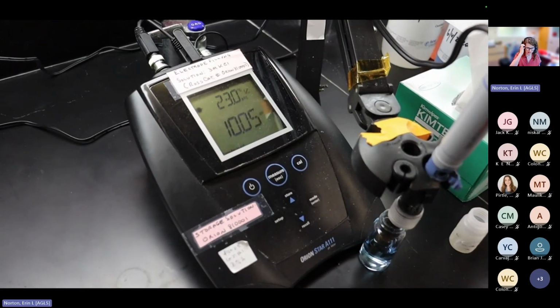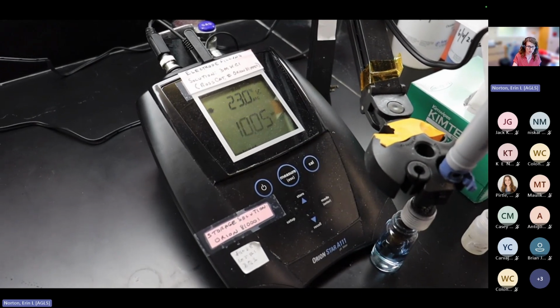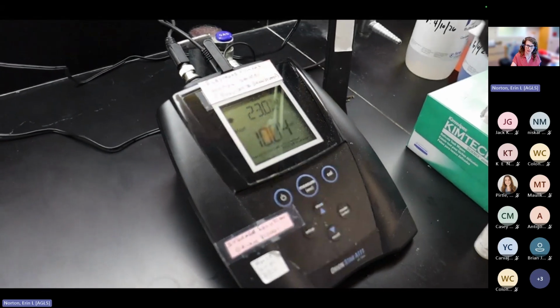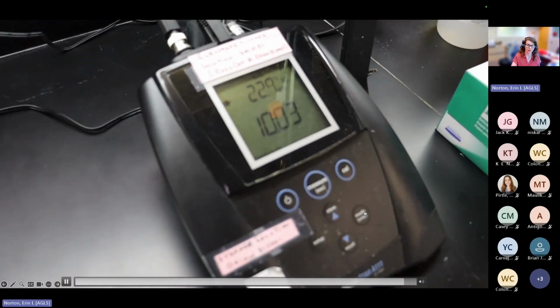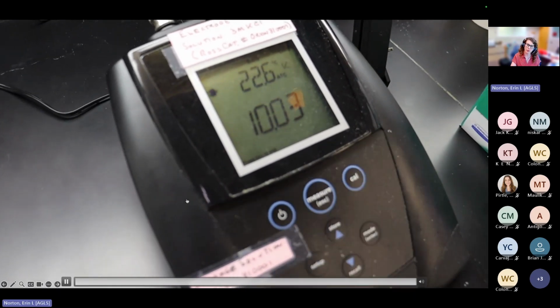10.0 is this calibration standard. And at the end of this, with our particular meter, we are going to hit enter, sorry, enter. And this is to give us our slope.